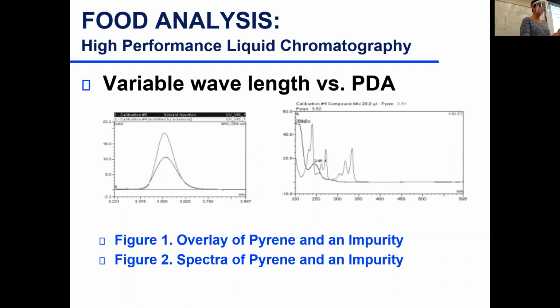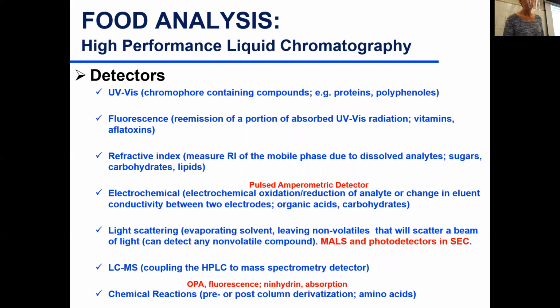But if they're co-eluting, like if you remember with caffeine in decaf coffee, we had the caffeine peak that wasn't pure. So we saw the caffeine spectra and we saw another spectra at the same time. And we said, okay, you might be overestimating your caffeine in the decaf coffee.